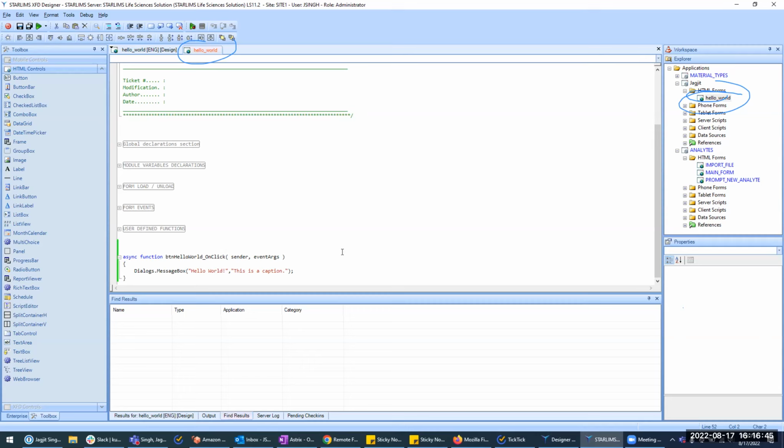Okay. I was going to take half an hour, so we have 15 minutes. I do want to go to the next exercise. Is everybody good with this hello world? So we can move on. Yeah. Yes. Anybody not get it? In my case, my computer froze a little bit, and it says that it cannot search. You couldn't find the search. That happens a lot, Jose, it times out on the search. So forget about the search for now. But all good. I managed to understand, and we did it yesterday.